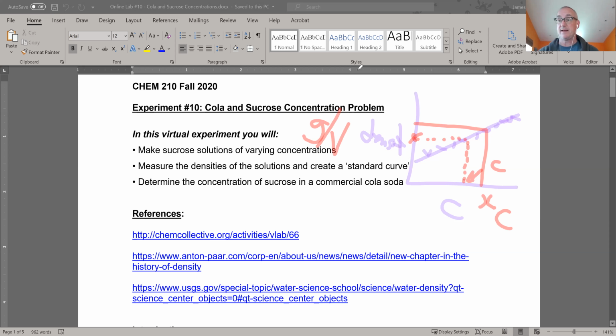What's another method we could use to get a more accurate answer, just in case maybe we're plotting this by hand and we don't have a really good straight edge or whatever? So Ferris, how would we go ahead? Vaporize the solution and see how many grams is there. No, I'm talking about we could do that. I'm talking about how do we use this graph in a different way to get a more accurate number for our concentration. Get the gradient of the graph. What do you mean by the gradient? I think I know what you mean.